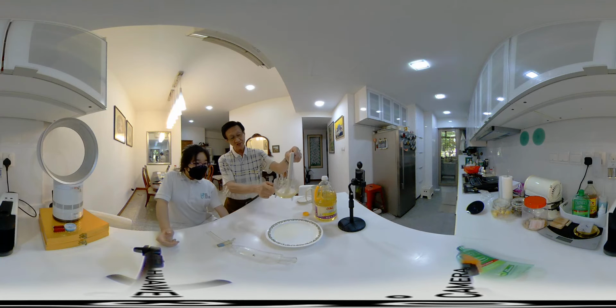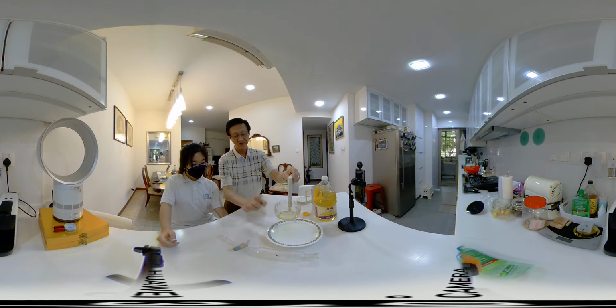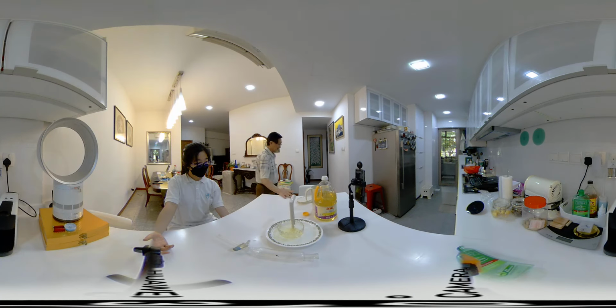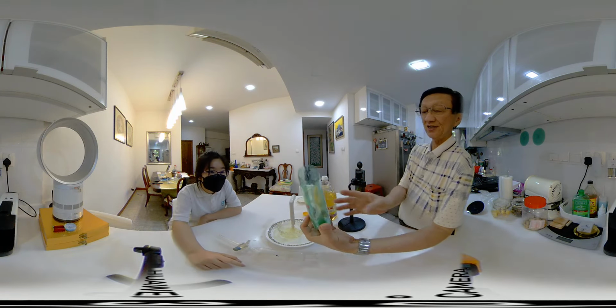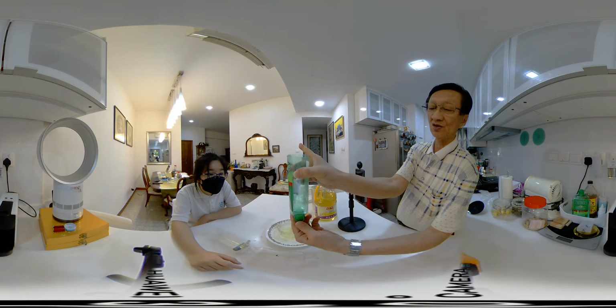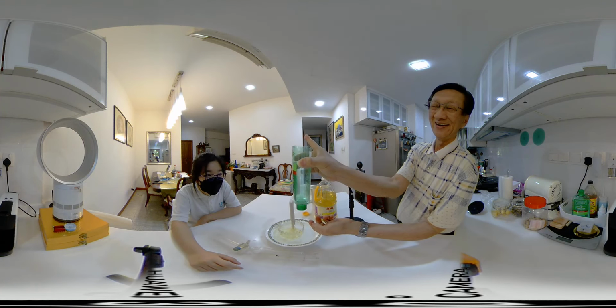So there you are. This is a housewife separating funnel. This is a chemist separating funnel. Of course this one costs much more than this one. We have done this cheap separating funnel, and this cheap separating funnel, again we can put the oil in and the water and let go the water out first by letting go here.